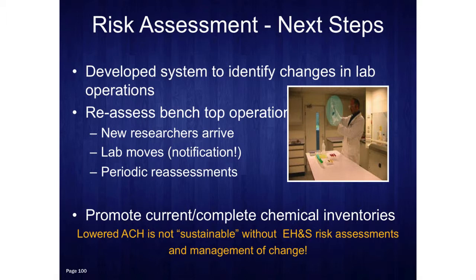So we feel like, once you go out there and you start assessing things, you will find that there are a lot of labs where there aren't a lot of harmful activities taking place on the benchtop, or you'll identify areas where you can implement good industrial hygiene practices and move the practices to a fume hood or another local exhaust ventilated enclosure.